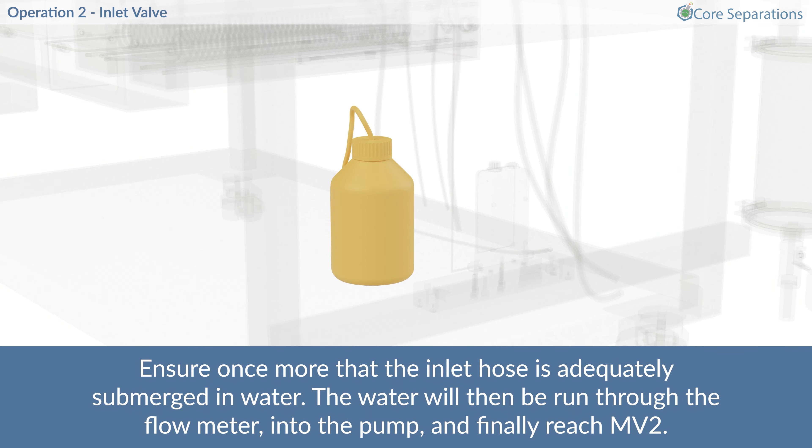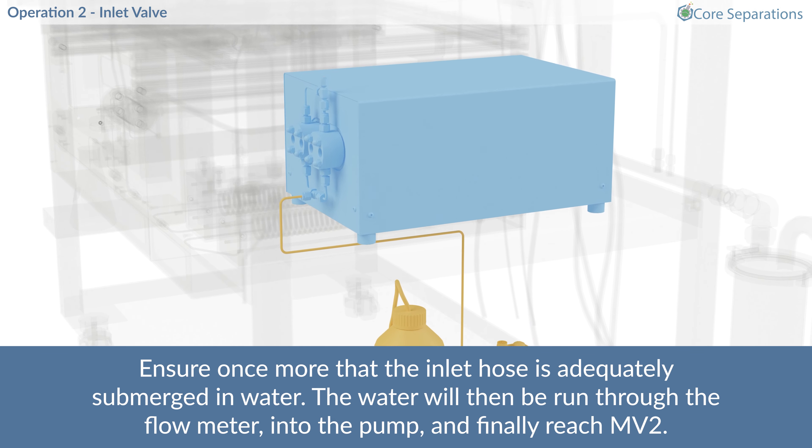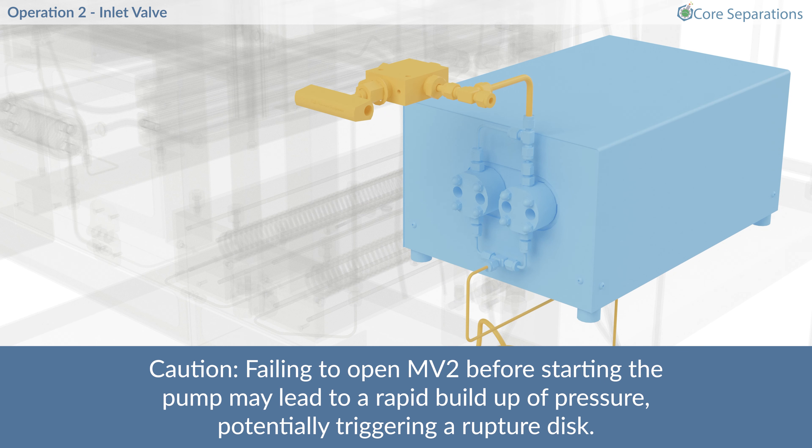Ensure once more that the inlet hose is adequately submerged in water. The water will then run through the flow meter, into the pump and finally reach MV2. Caution! Failing to open MV2 before starting the pump may lead to a rapid buildup of pressure, potentially triggering a rupture disk.